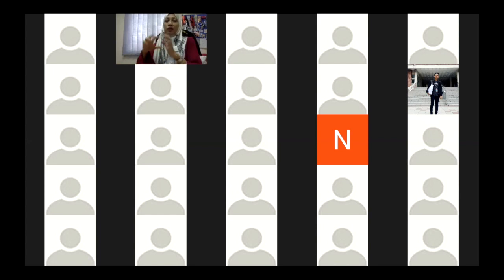The column, I'll show you the YouTube video later, is specific for the different compounds that you want to detect. For example, for ABE, if you are using the Shimadzu brand, the most popular column used is BP20, B for Britain, P for Poland.